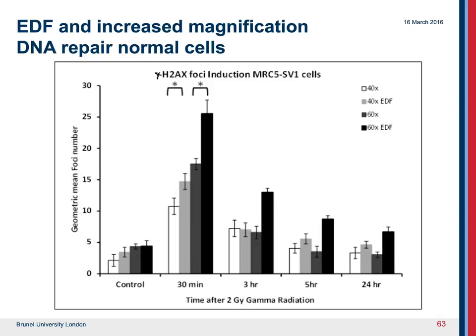So again, that's really nice. This enhanced magnification and the extended depth of field is allowing us to see more damage within the cell. So that's probably approaching in situ immunofluorescence techniques using an epifluorescence microscope.